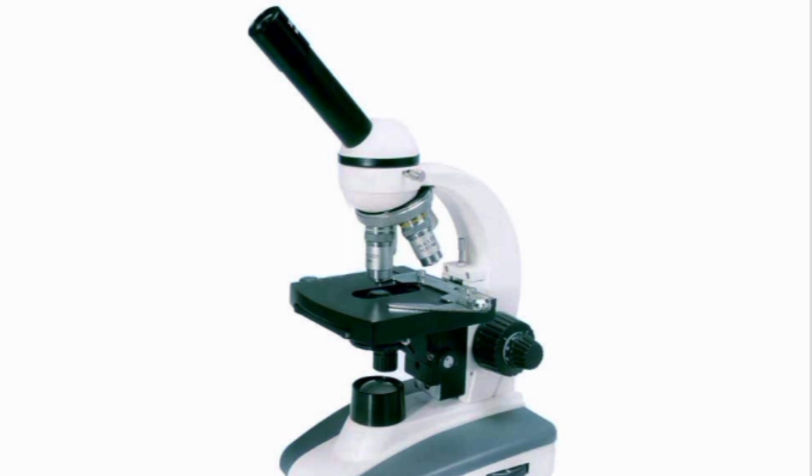You can see that it has just one eyepiece. So please master the similarities or the differences between the binocular compound microscope and the monocular compound microscope. All right, next slide.